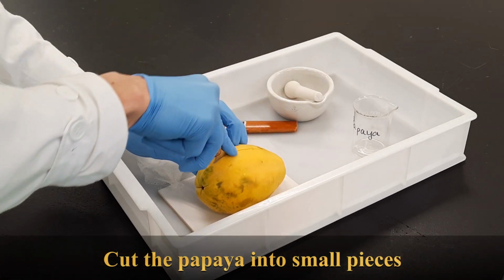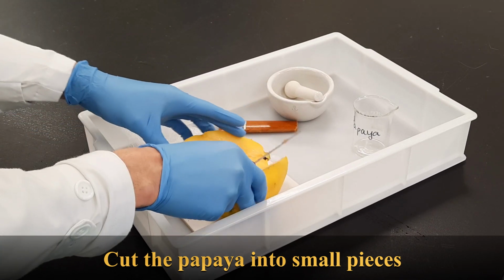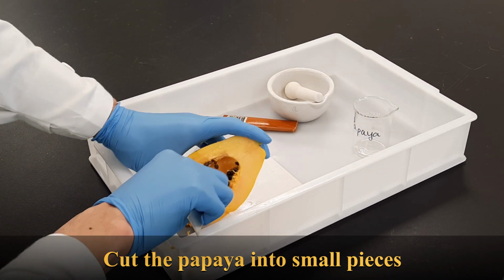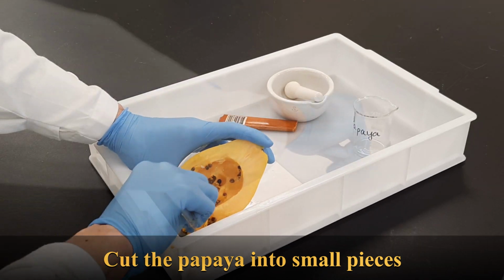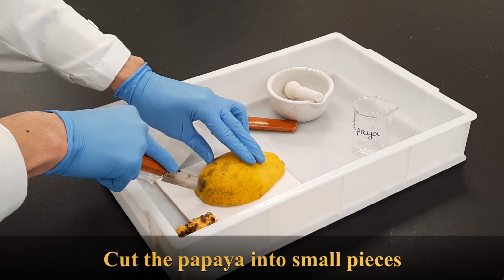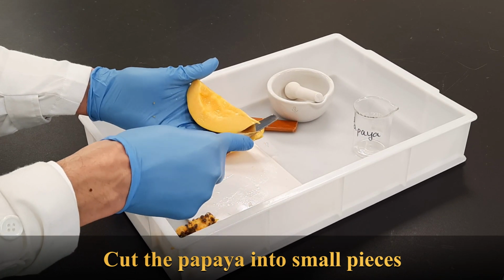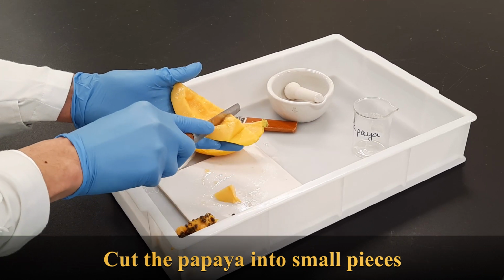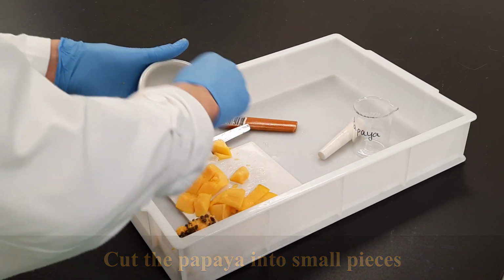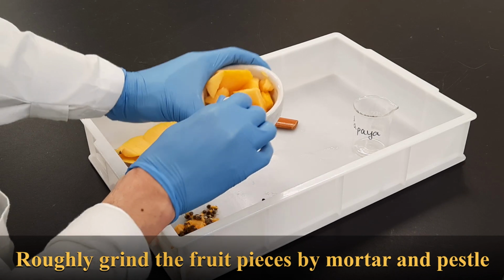Cut the papaya into small pieces. Roughly grind the papaya pieces by mortar and pestle.